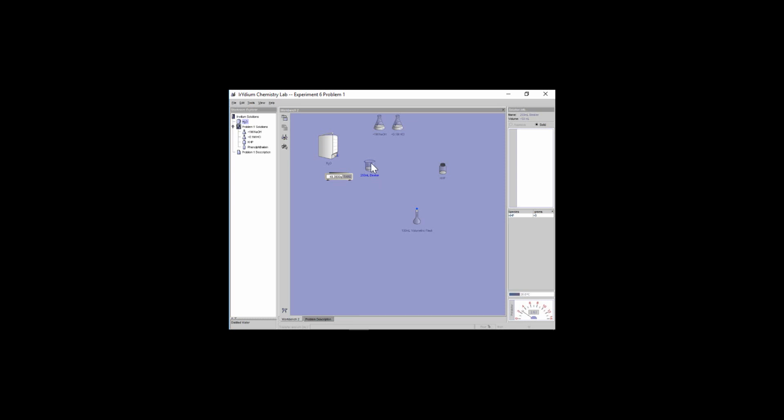And what I'm going to do is transfer that 30 ml of solution. I'm going to pour that into the volumetric. It already zooms in for me. This one mark here would be 100.00. Well, I only had 30 in there, so let's just transfer in 30 mils. So there you go. Basically, all of it's there. You'll notice, hey, I still have some liquid left over. Well, that was only 30 mils, and I'm not up to the mark yet.